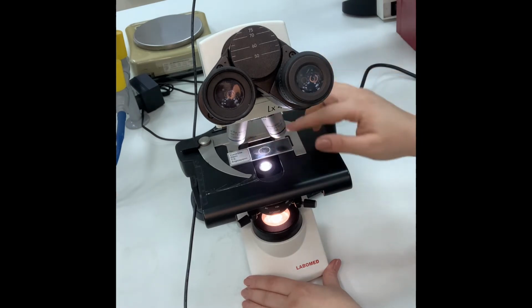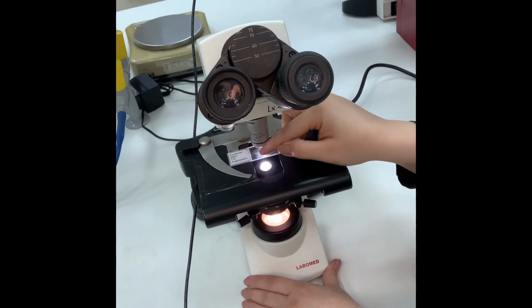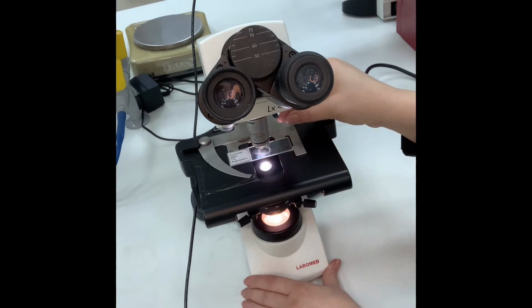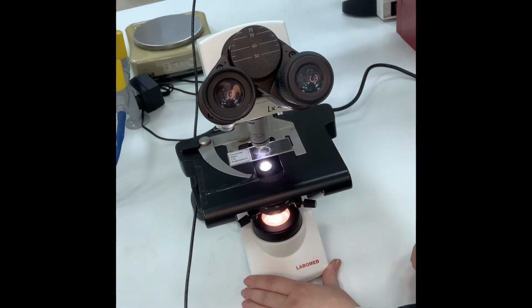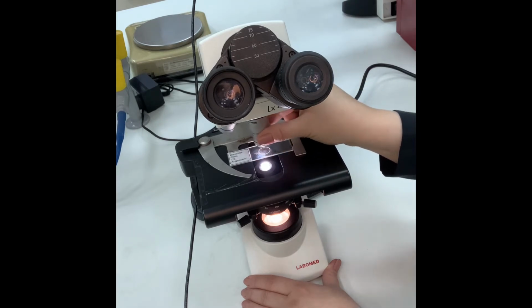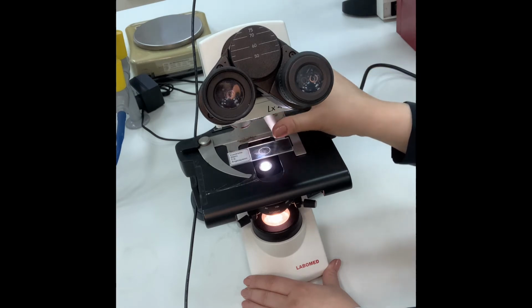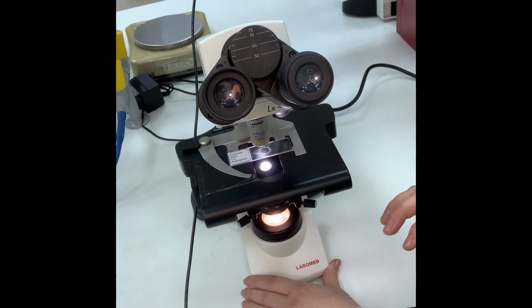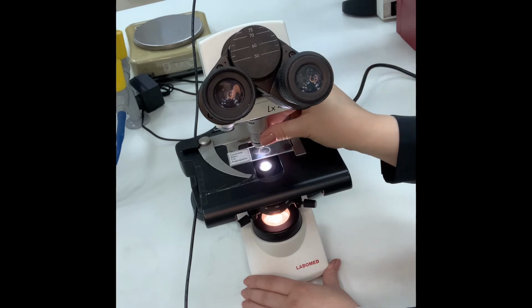But when you use the 100, I have to use a certain oil, just one drop on top of the slide, because objective 100 will touch the slide, and that will cause a friction and we will break the slide. So the oil will facilitate the movement of objective 100 only while using objective 100, okay? But for 4x, 10x, 40x, I can move the revolving nose piece freely and without even touching the slide. But for 100, it will touch it.